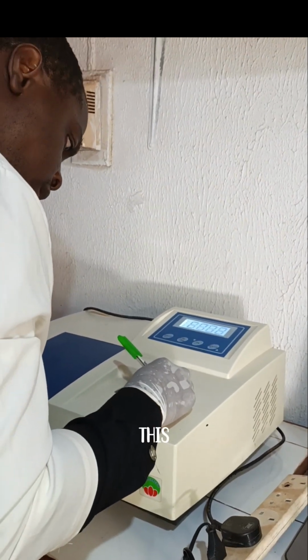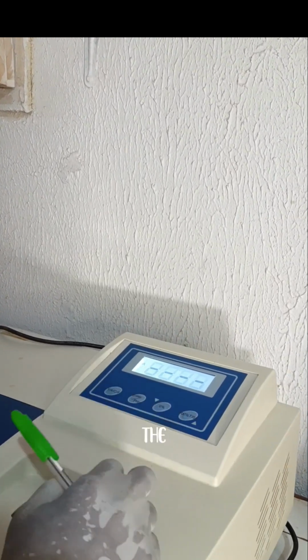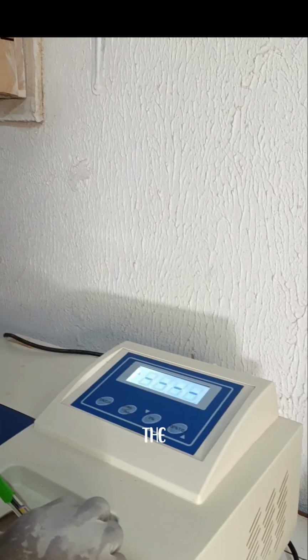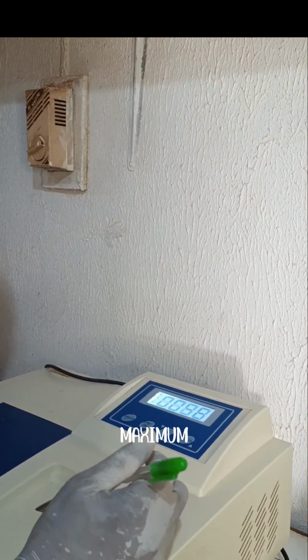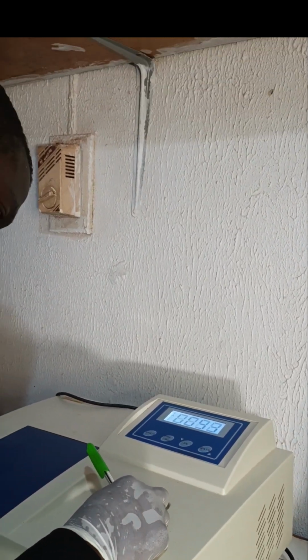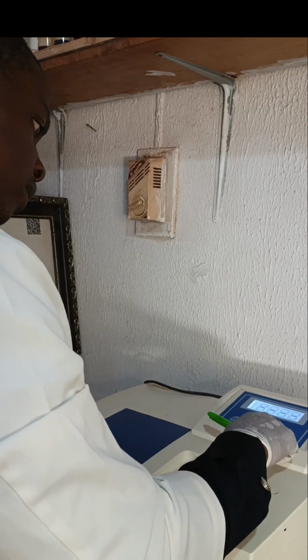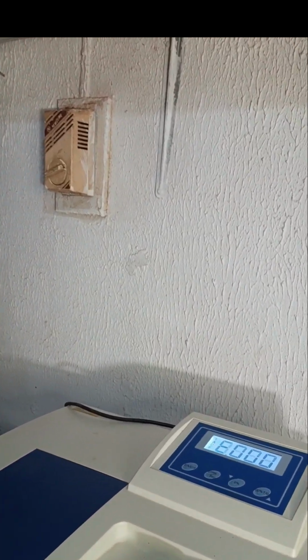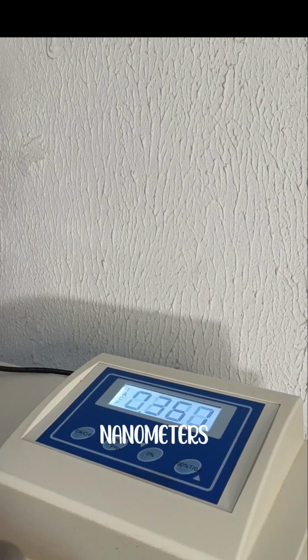Then we are just scanning through the wavelengths to get the wavelength where the machine will show the maximum absorption. This is 600 nanometers.